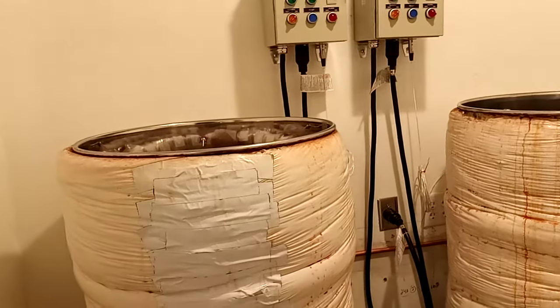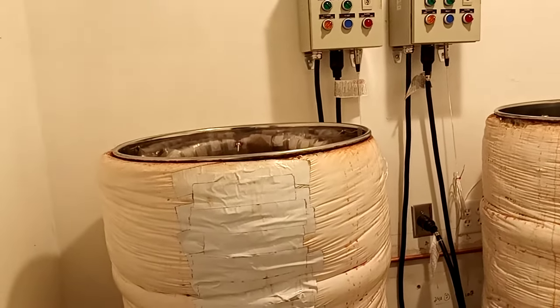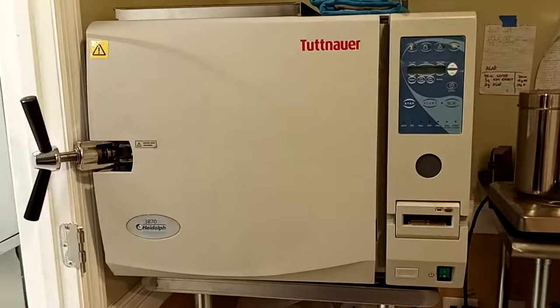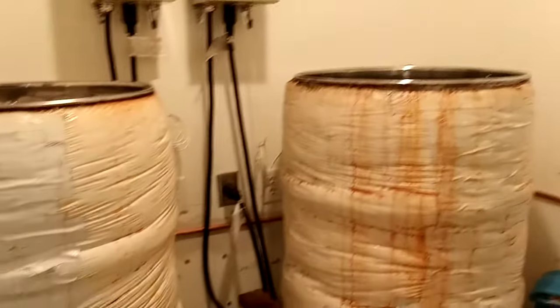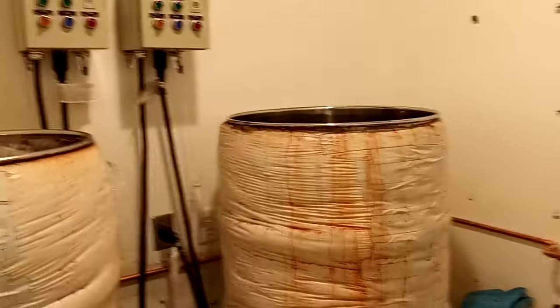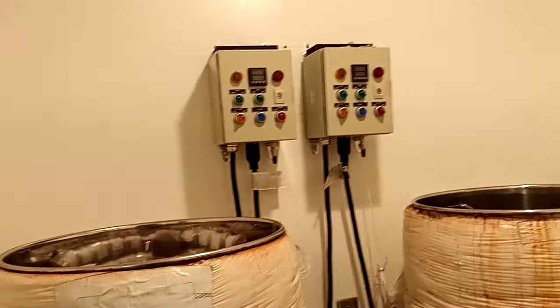Most of our sterilization is done through the atmospheric steam sterilizers, although we do use our autoclave — our Tuttnauer — for instrumentation and for liquid culture. So we don't do liquid culture or instruments in these sterilizers.